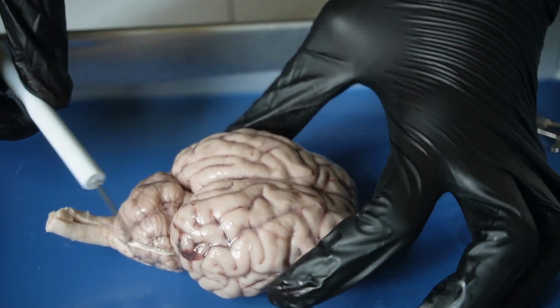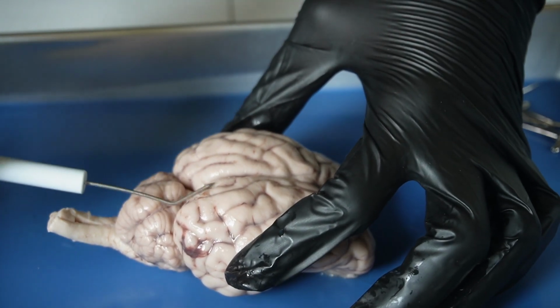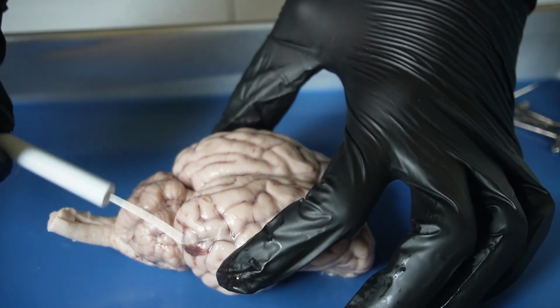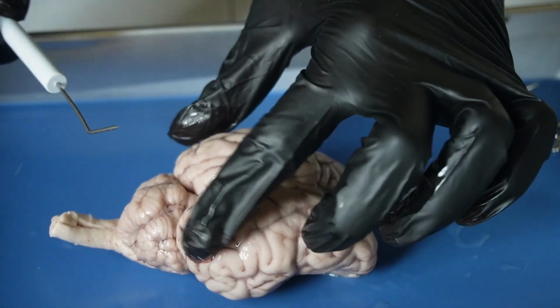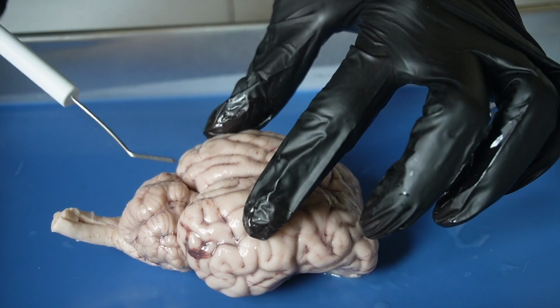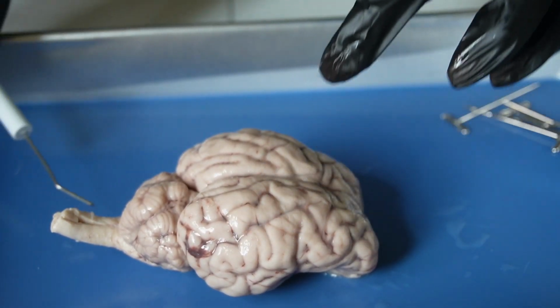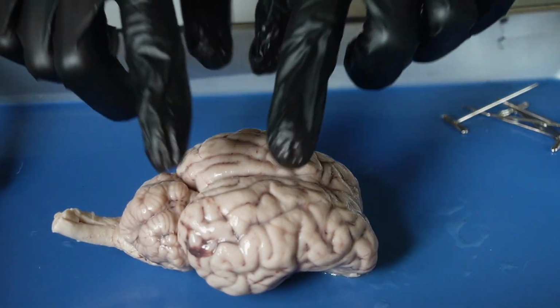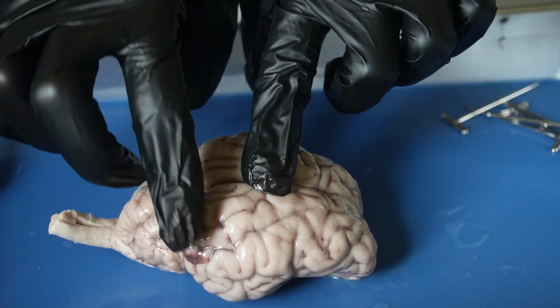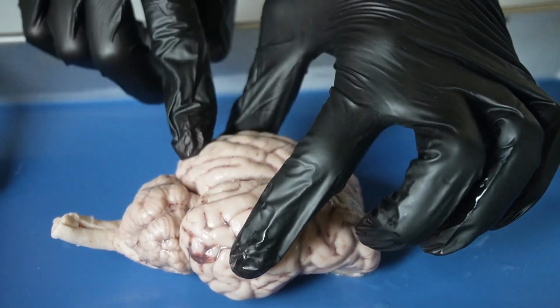Then we have the occipital lobe, which is posterior to the parietal lobe and proximal to the temporal lobe. So that's this section here. The occipital lobe is the portion of our brain that processes visual stimuli. So right now my occipital lobe is processing what I am seeing, which is the sheep brain here.